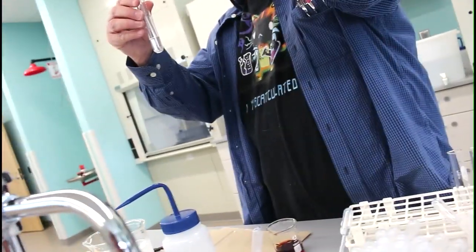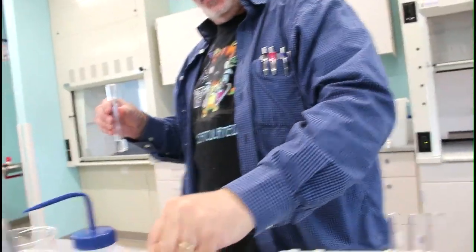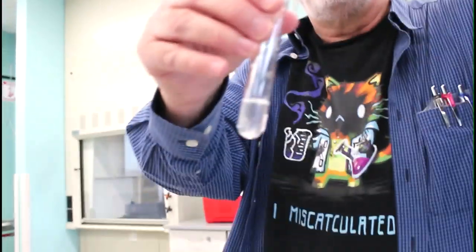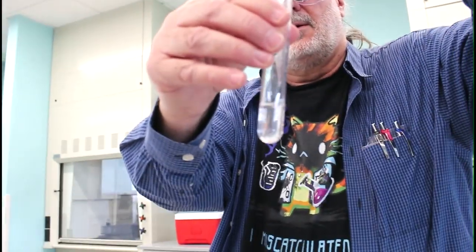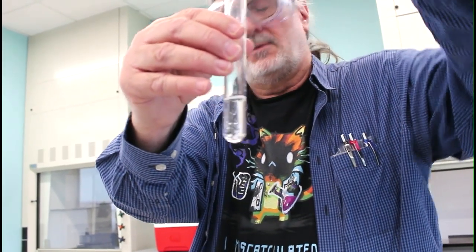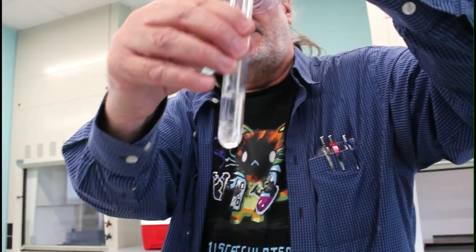Then I'm going to add another milliliter. I'm going to break that clump up as best I can. And then I'm going to add another milliliter of the ammonia. And I'm going to stir it.